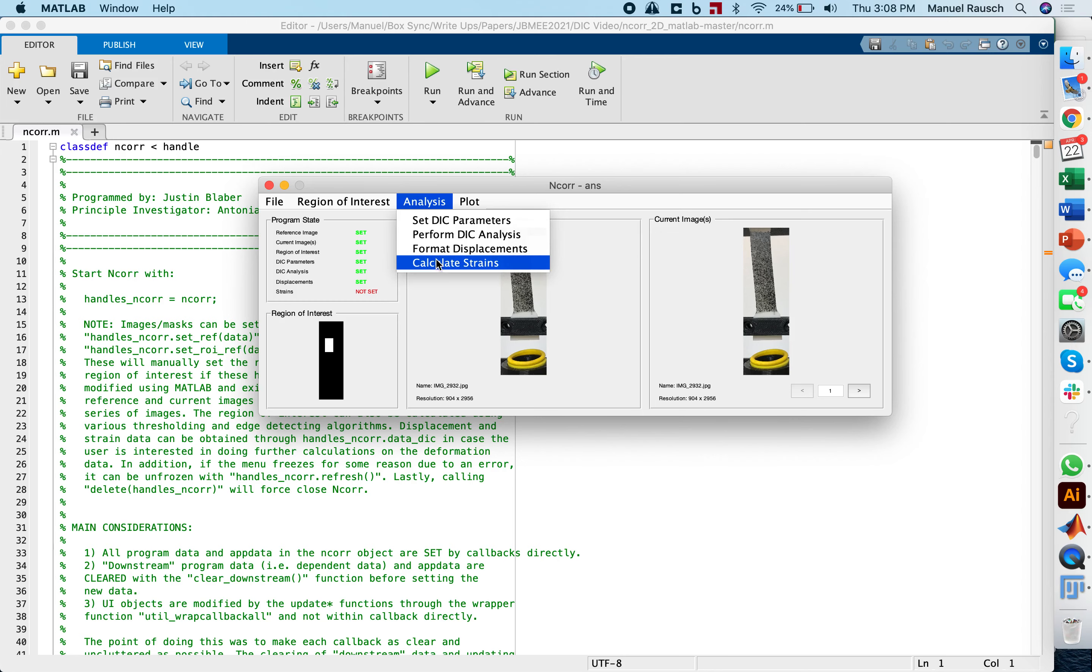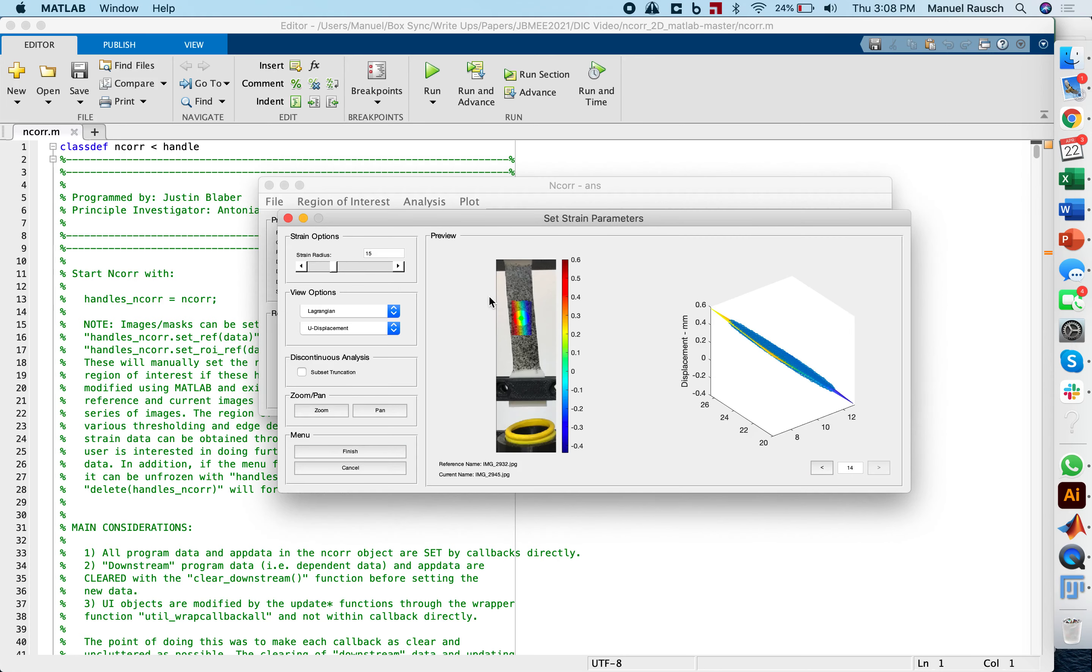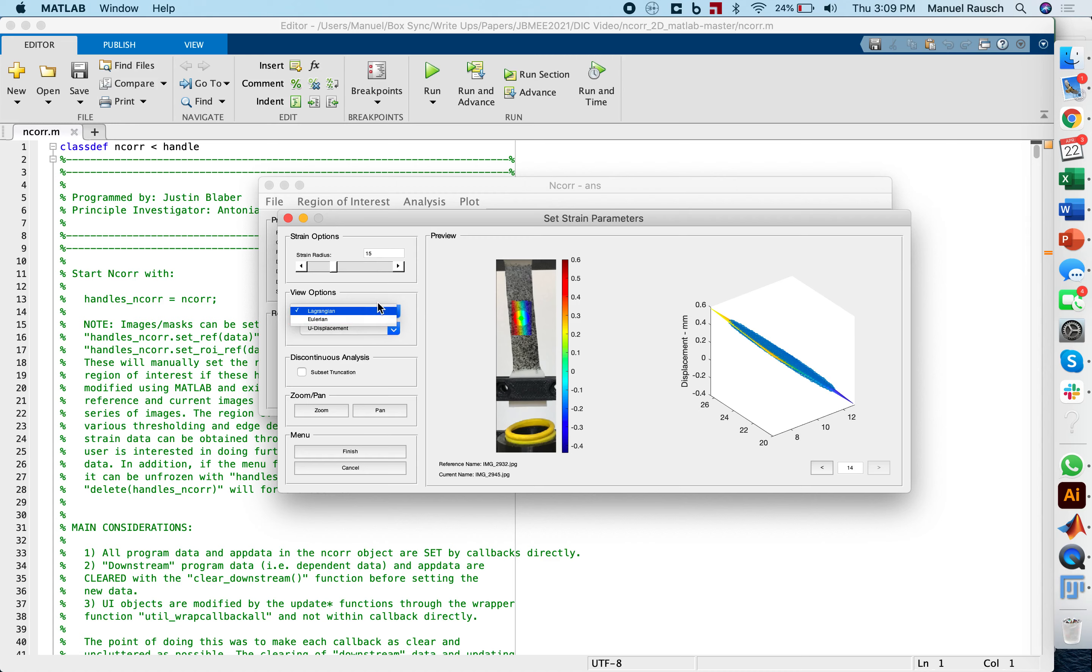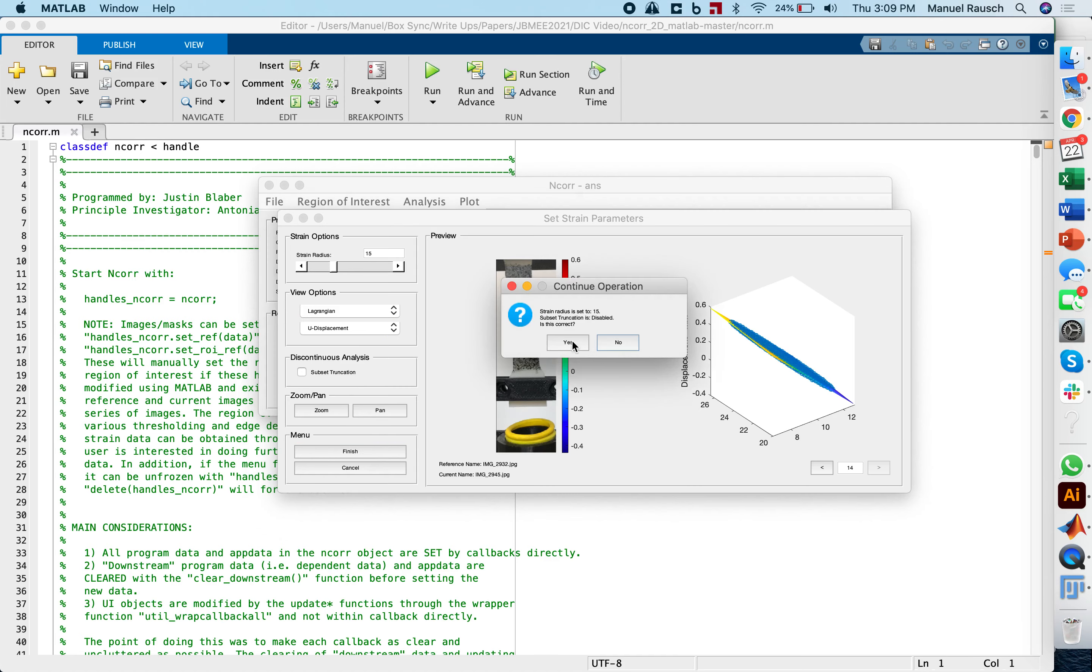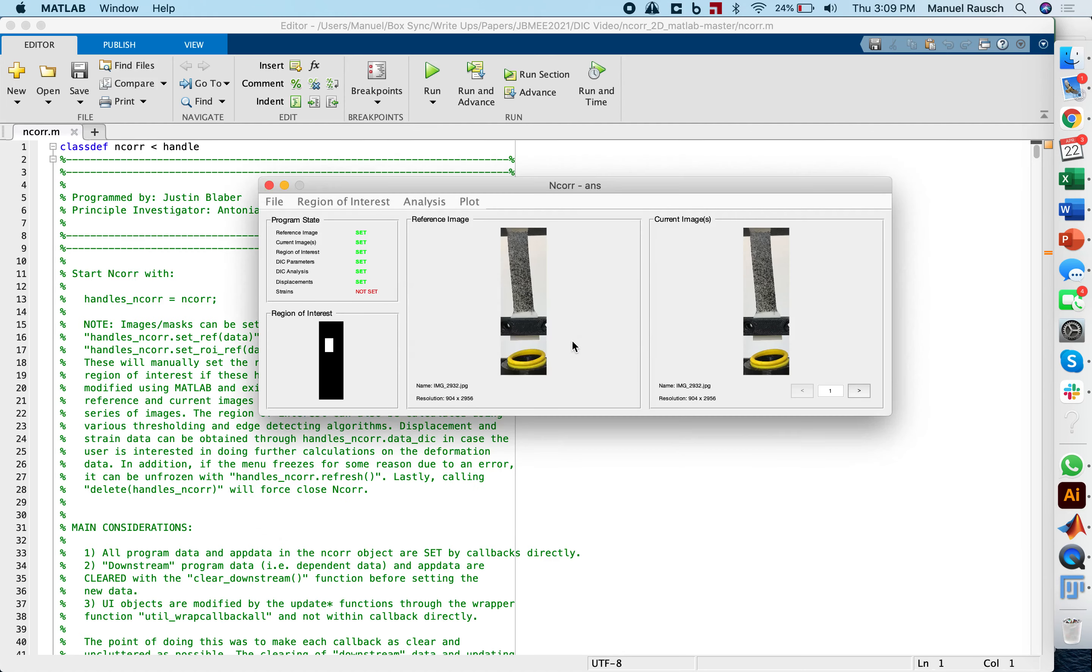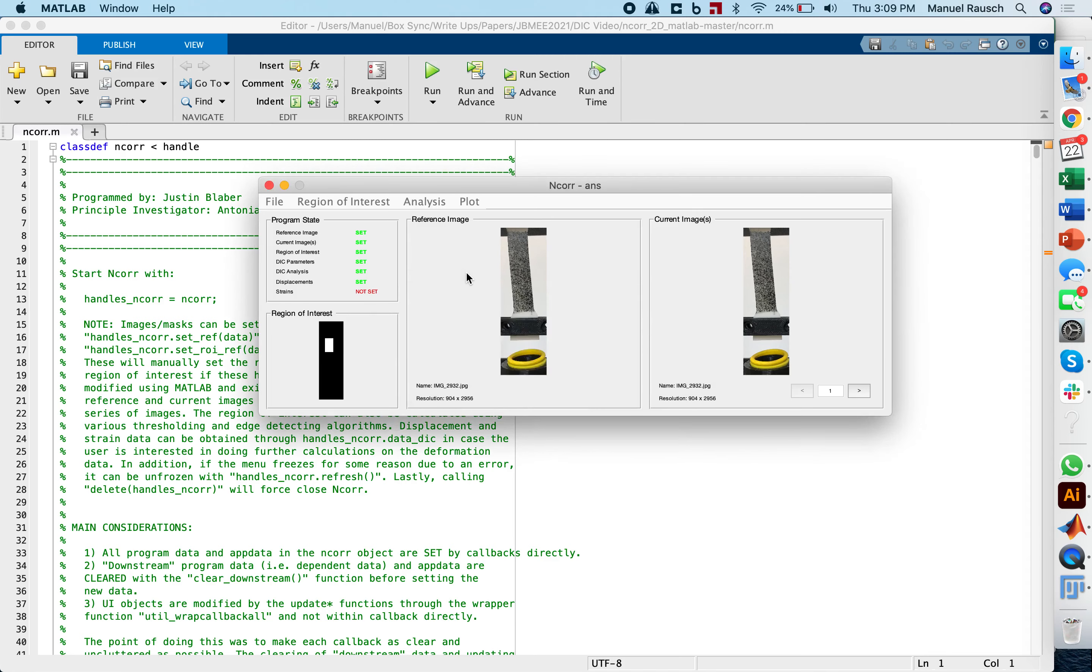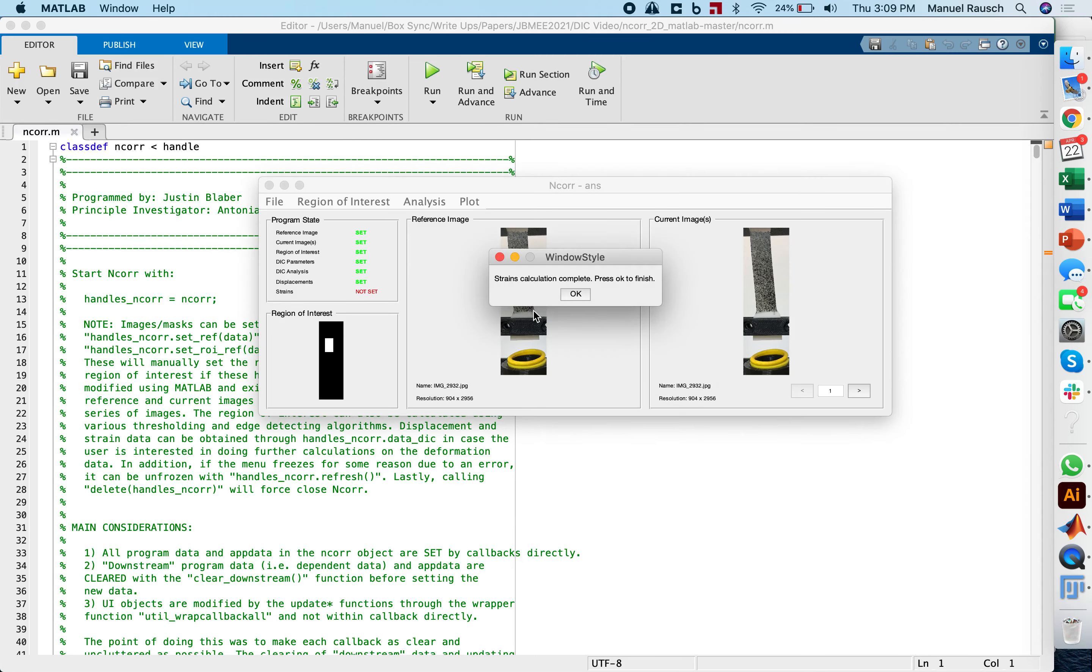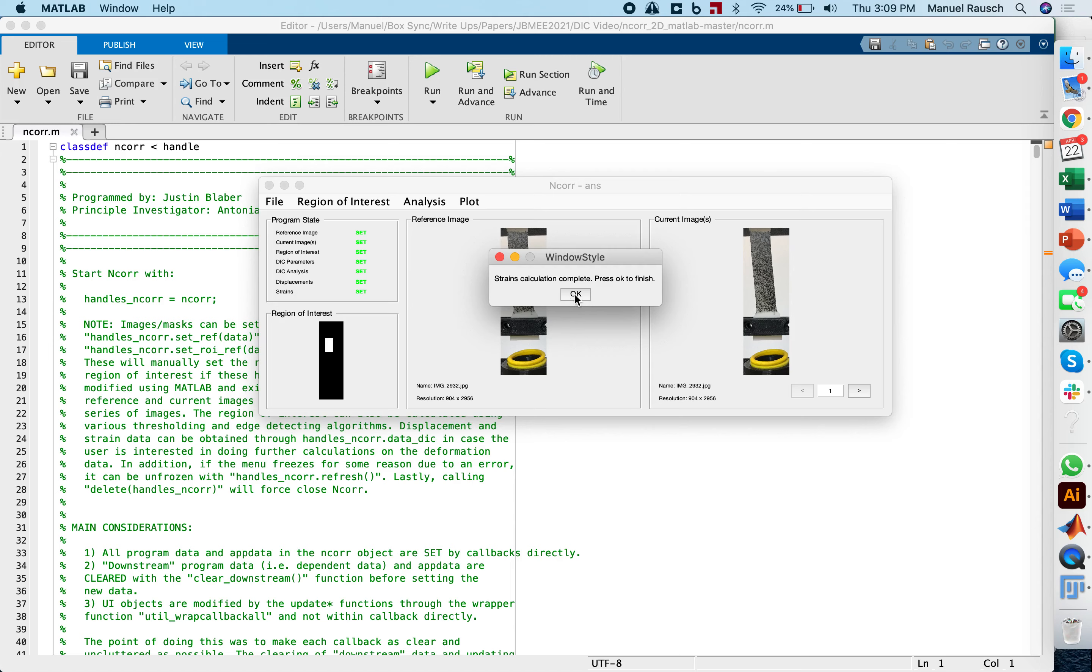And now the final step is to actually calculate strains. When we do this, we can set what kinds of strains we want to analyze. We have the options here between Lagrangian or Eulerian. I'm choosing Lagrangian strains here. All we need to do now is to actually click finish, confirm this option. We go through another 14 images. But with them being done, we're actually done with this analysis. So strain calculations are complete. Press OK.